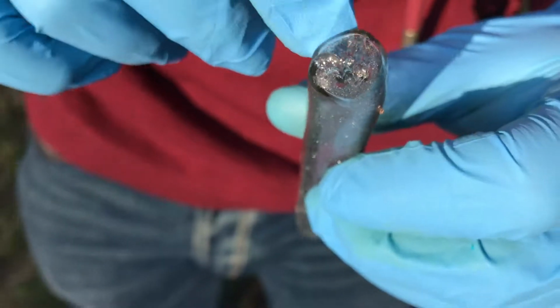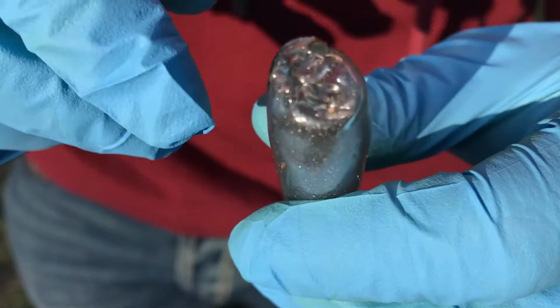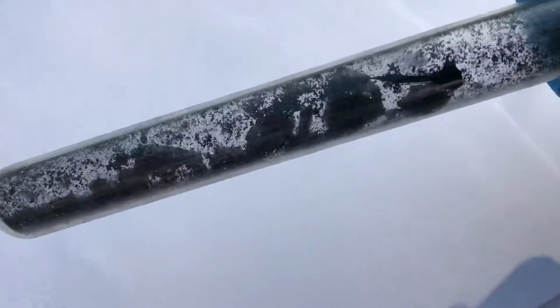Some crystals broke into smaller pieces due to bad transportation. However, I have some big crystals there too. There is actually a portion of melted iodine that has frozen on the wall of the ampule.